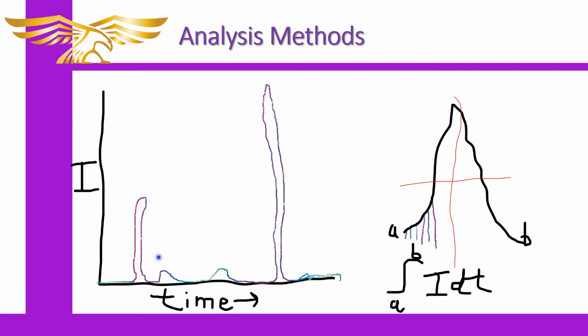So when you're looking at these gas chromatography printouts that you'll get, they'll actually look a whole lot better than this, because we've been using more computerized samples lately instead of the older ones. We used to have older ones that used a strip chart. Now we have a newer machine that's got a robotic auto sampler, and they usually just run all of them on those, and they have a set, and then they'll put some instructions and assign it on iLearn, and you can just go and you have one to interpret. And that is better for some reasons we'll talk about.